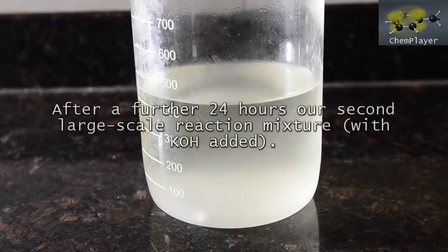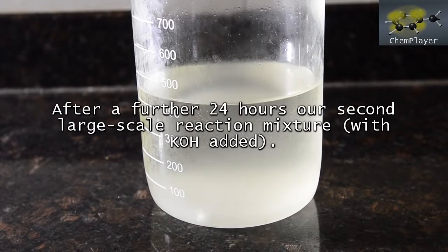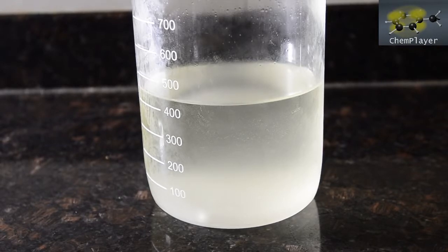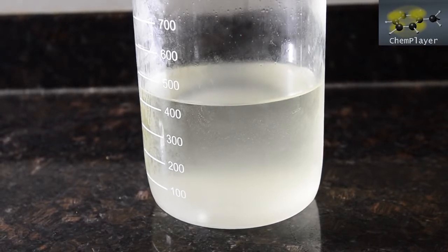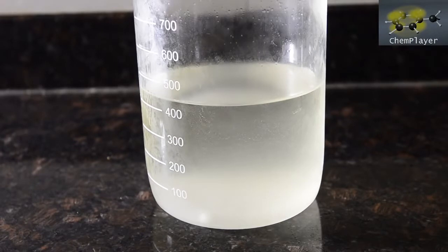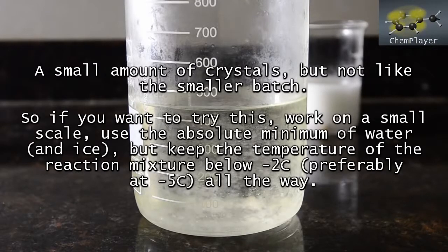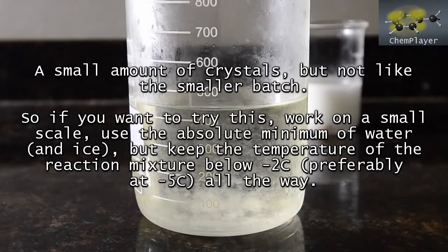Let's finally go back to the mixture from our second large-scale reaction. We added potassium hydroxide and then left for a total of 48 hours. There's a small amount of crystal, but not very much in here. So if you want this reaction to work, we suggest small batches, use the absolute minimum of water and ice, and use very good temperature control.